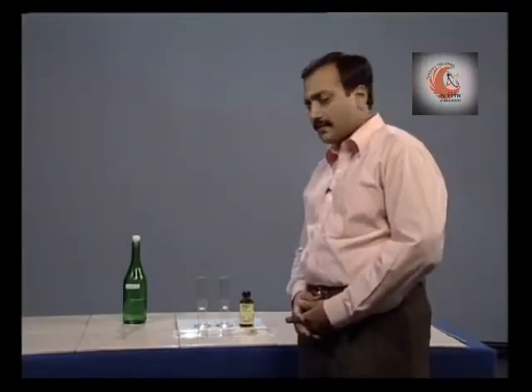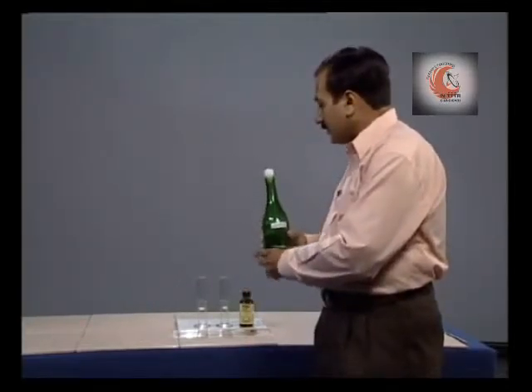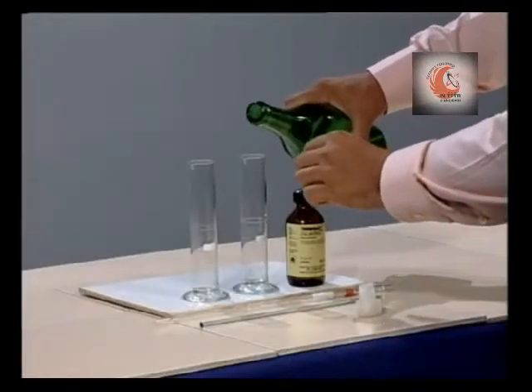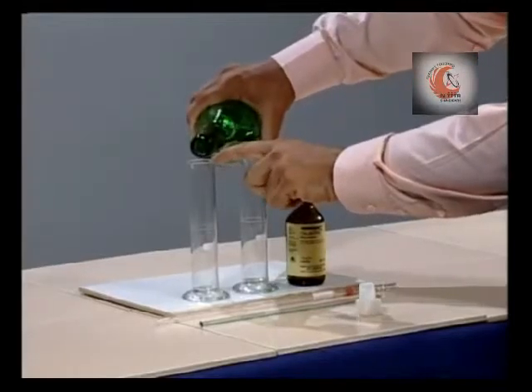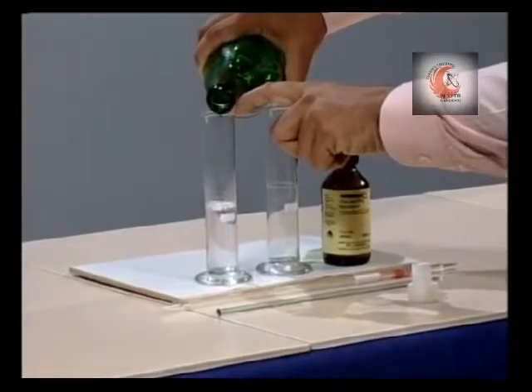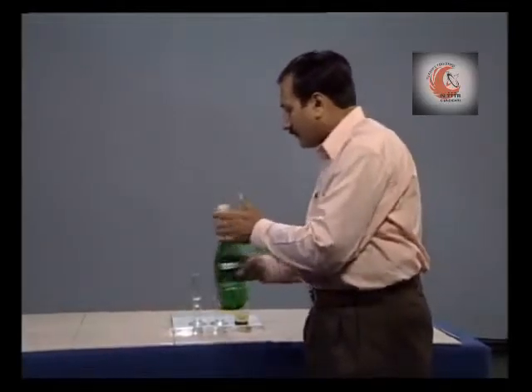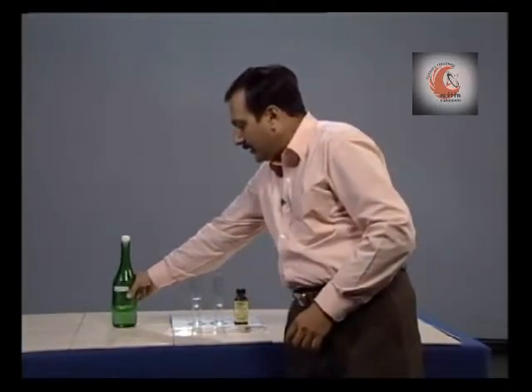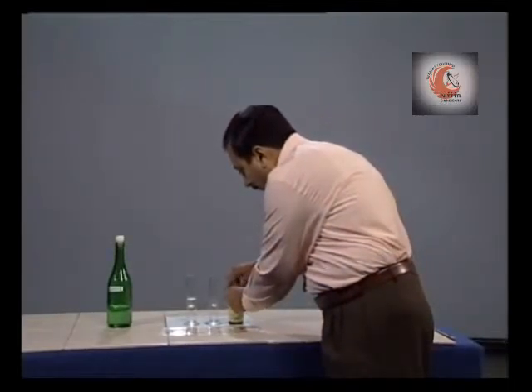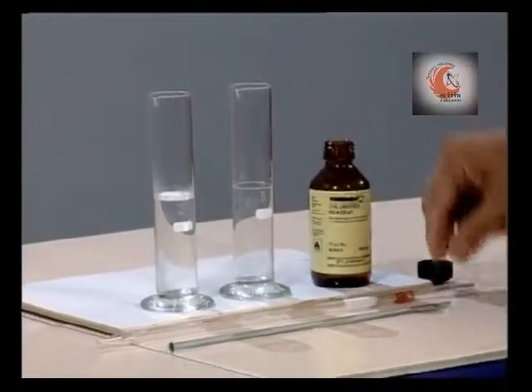The process is quite simple. In one cylinder we take 50 ml sample and in the other cylinder we will pour 5 ml of the reagent.